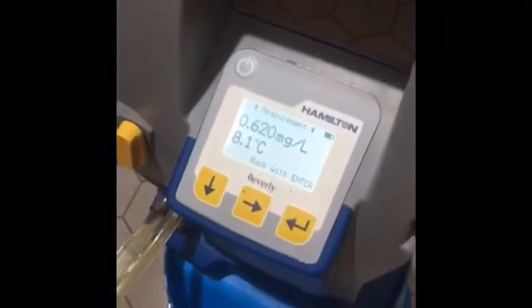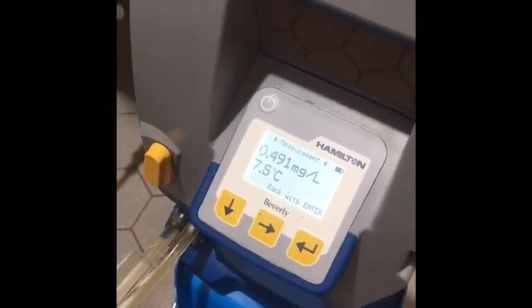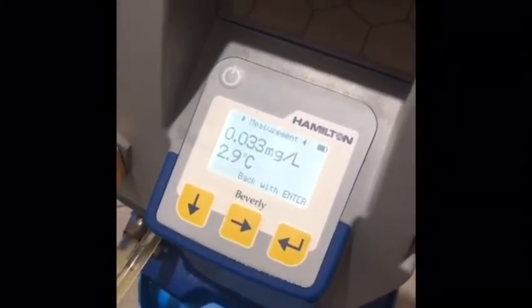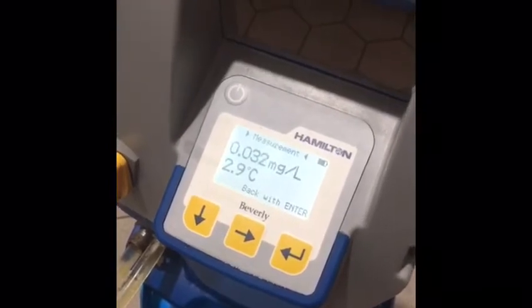At the beginning of the reading we want to fill the DO meter with beer, so we have the valve in the fully open position. Once the chamber is completely filled, we can restrict that flow back. Then we're waiting for the temperature and the oxygen reading to stabilize. After 30 seconds to a minute the temperature and oxygen levels typically stabilize, and at that point we'll record it.